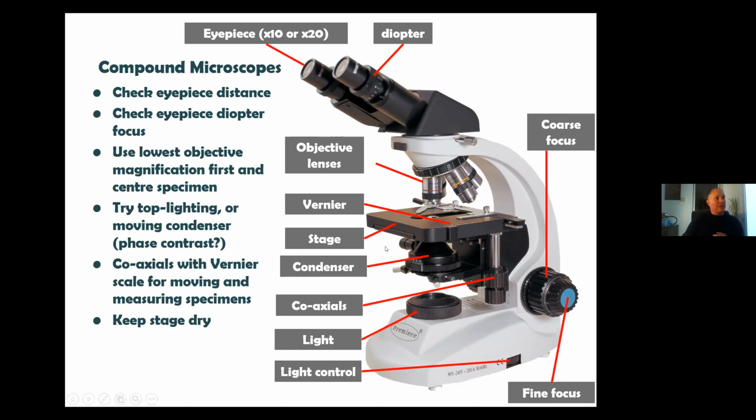Another thing that's worth doing is I tend to just put specimens in a well slide in the alcohol that they were collected in or stored in, and I'll identify them like that, and then I'll take them out still loose, and I will store them in more alcohol again. So I very, very rarely, if ever, make a permanent mount, which is probably something that you will think is utterly horrifying, and perhaps I should, but I find that I simply don't have the time. I dare say, however, there are some great microscopists out there that love making beautiful permanent mounts, and some of them are real works of art, so I will leave it to them perhaps.